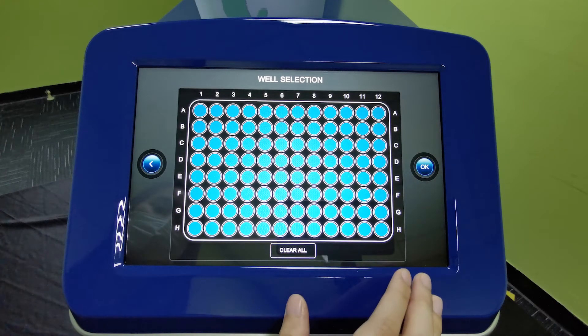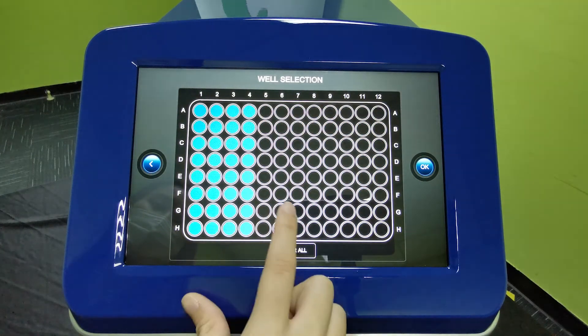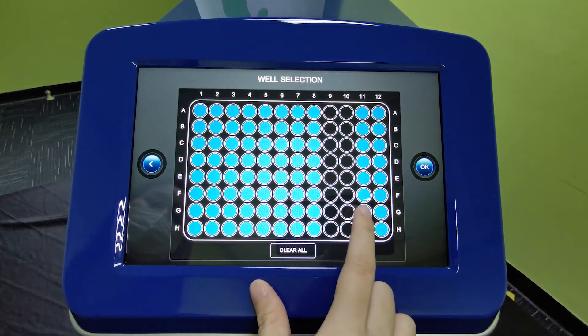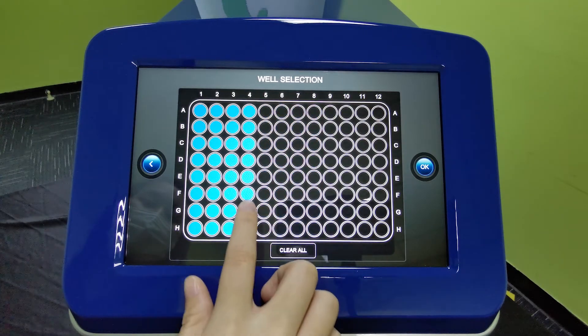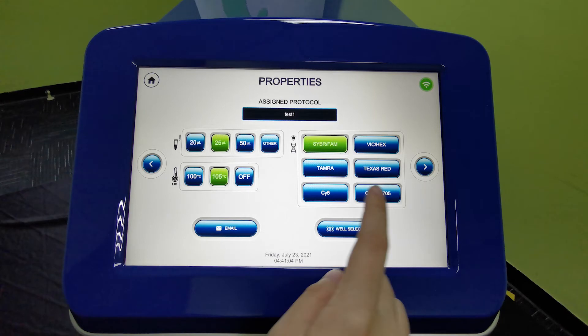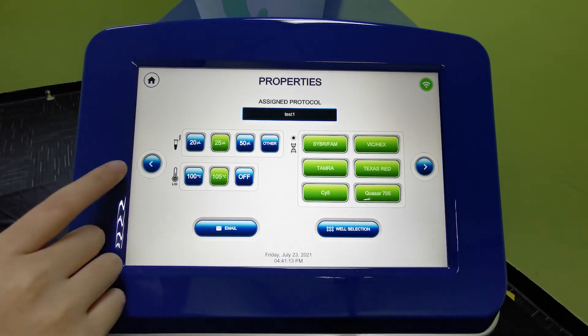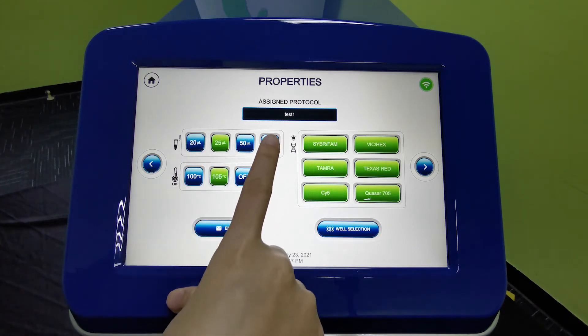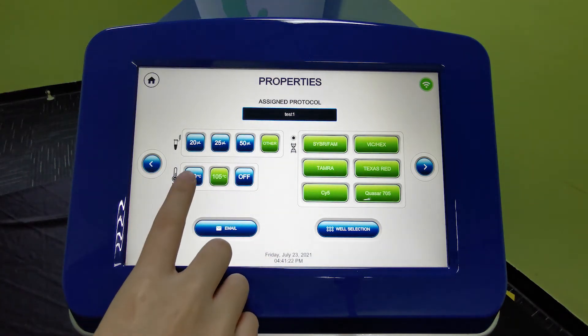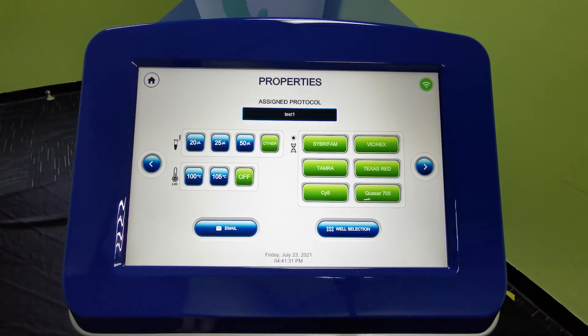This is where you can select wells, choose your dye, select your sample reaction volume, and your lid temperature. Everything is selected by default in 96-well format. You can clear all wells and then reselect — wells are highlighted in groups of 16 because our system scans 16 wells simultaneously. You can choose the number of dyes to multiplex — selecting all six will highlight them in green. For reaction volume there are preset options, or you can input a custom volume. There is also an email feature that notifies you of completed runs and data, which is essential for overnight experiments.